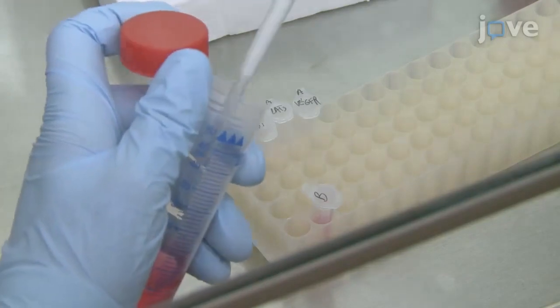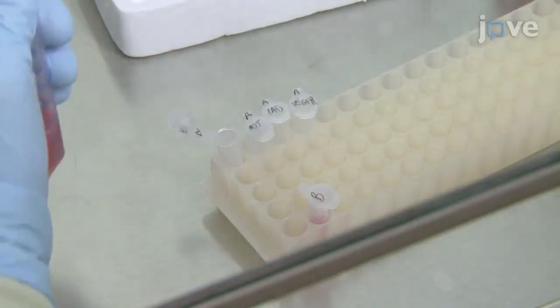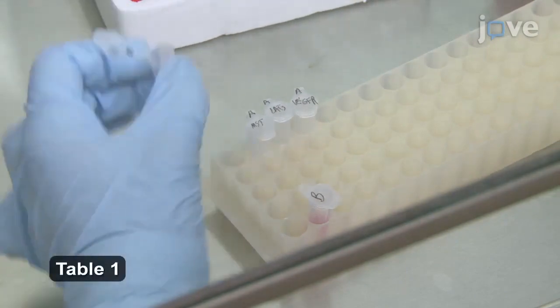Next, prepare Solution A, a DNA solution, and Solution B, a diluted polymer-based transfection reagent, as described in the text protocol.